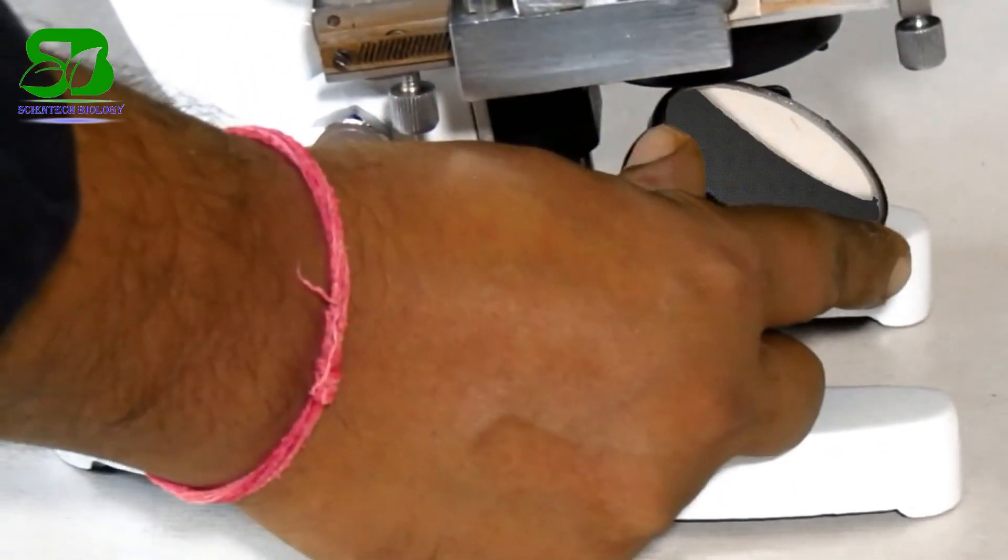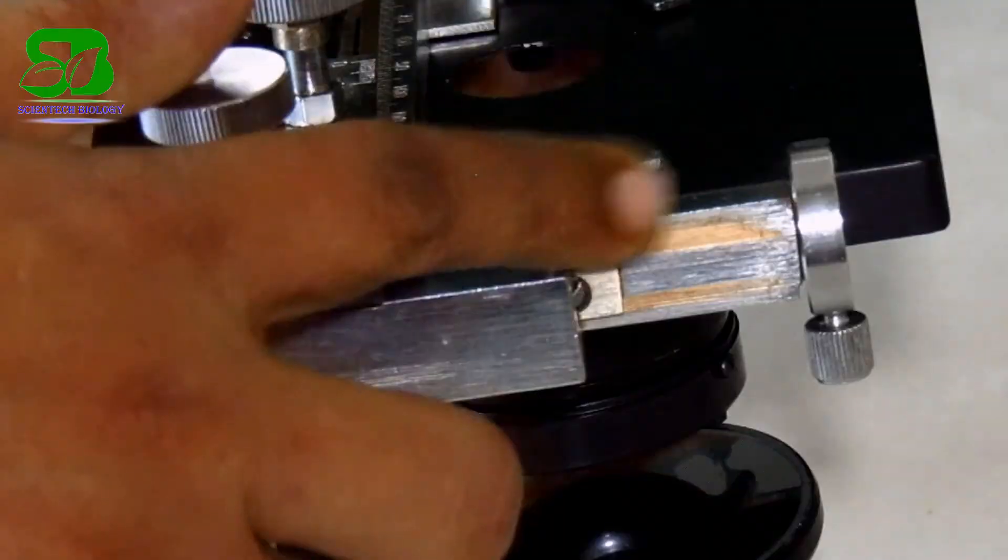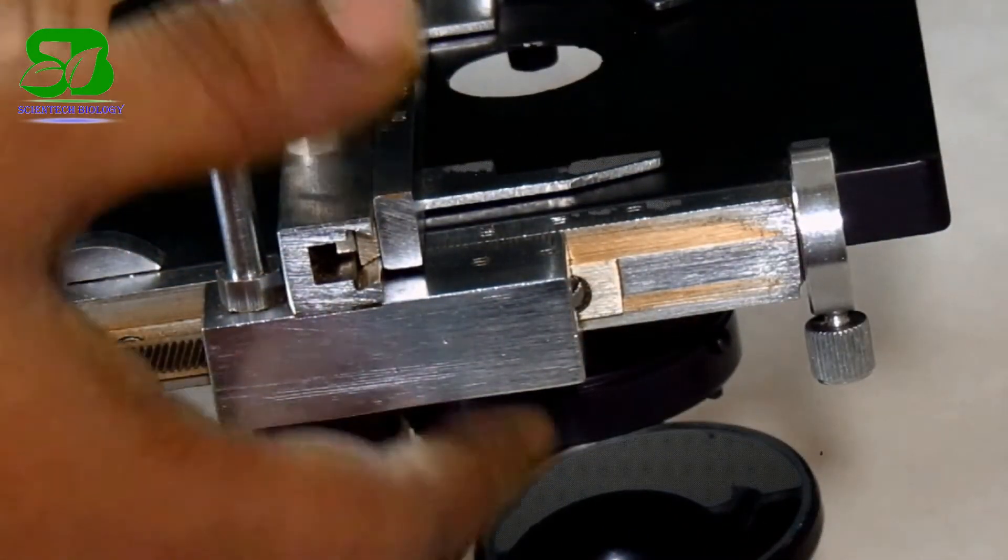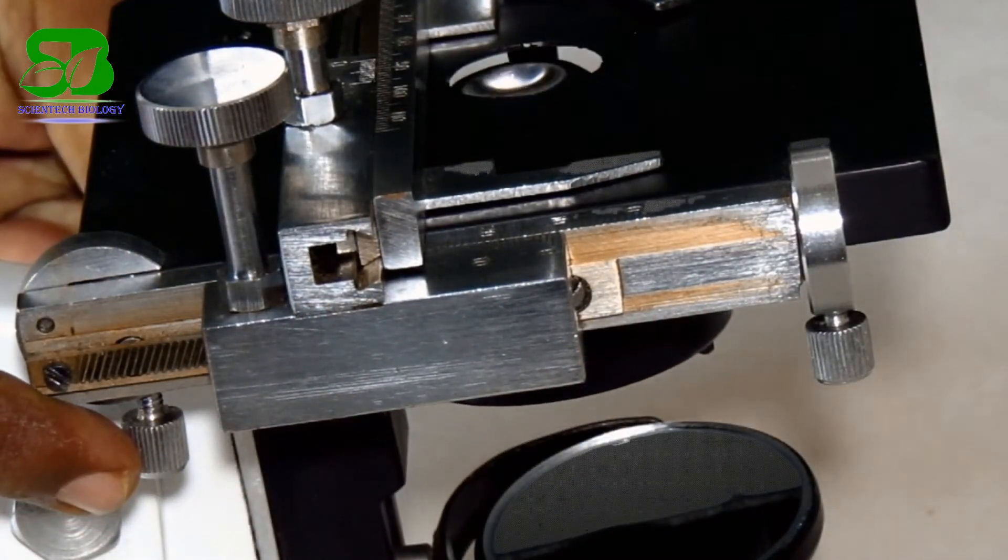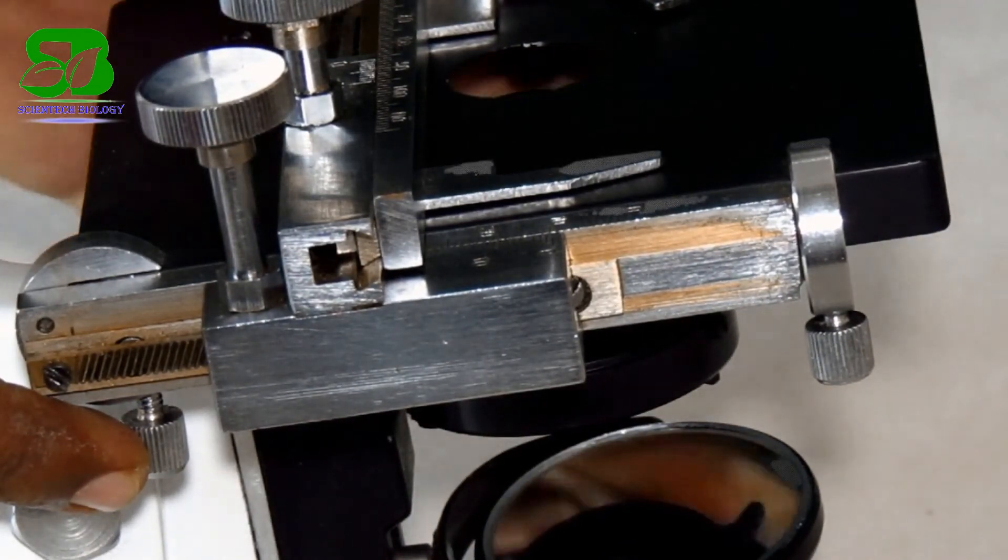Here at the bottom you can see a plano-concave mirror that reflects light to the object for a clear view. Just below the stage there is a condenser consisting of iris diaphragm. Through this point you can open or close the diaphragm completely.